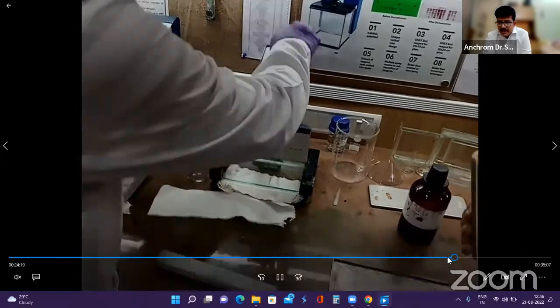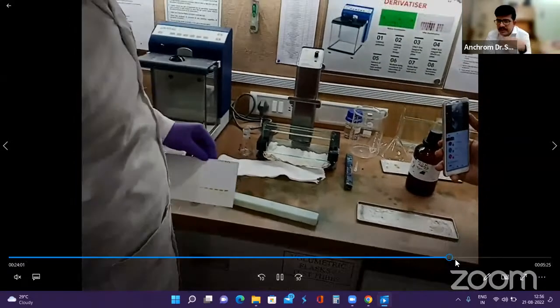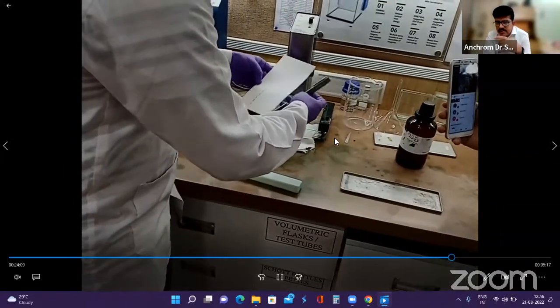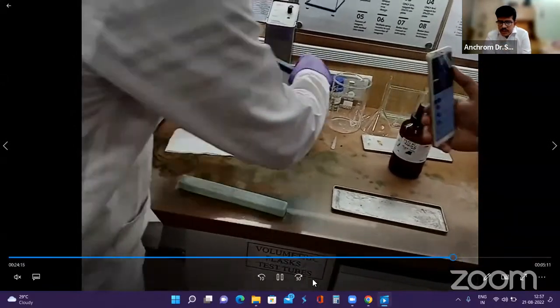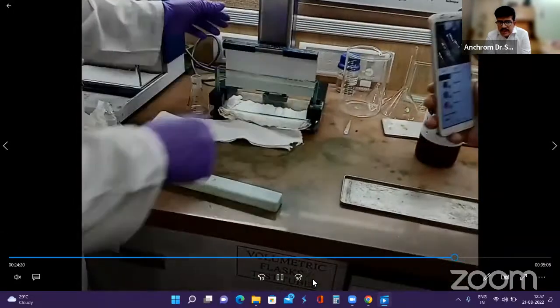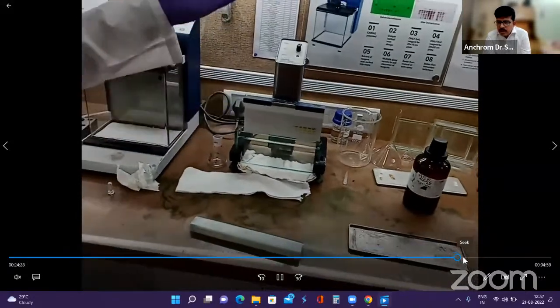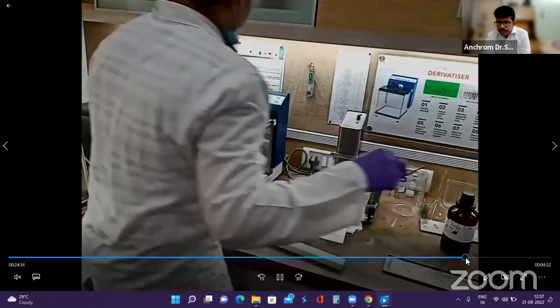So this is about the TLC-MS, and this is the immersion device I was talking about. We have seen already the sprayer, the derivatizer. This is the immersion device. So here we load the plate in this way, and the glass dip tank you can see at the back of his hand has the reagent, and simply he'll attach it onto that holder, and with the press of a button, this will go inside like this and come out, and the derivatization process is completed uniformly without any dragging or diffusion. This happens really rapidly fast, and this is the derivatizer.